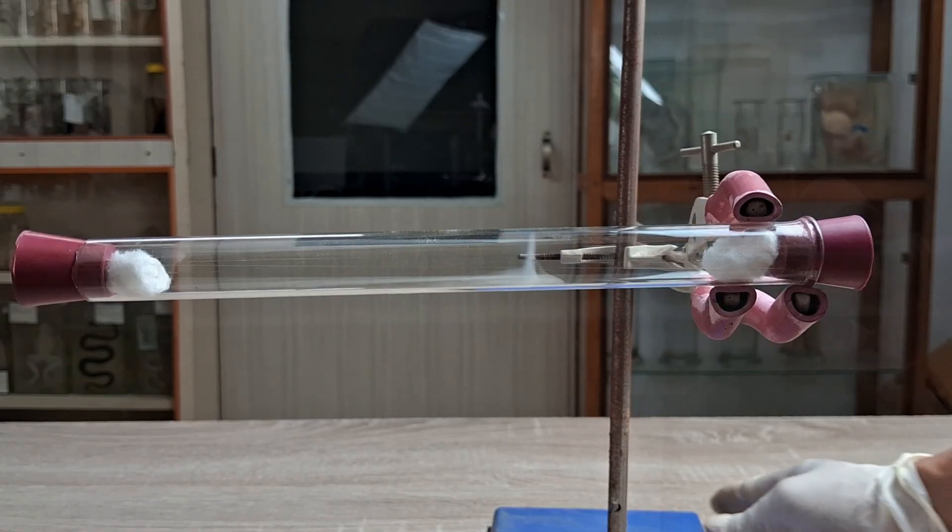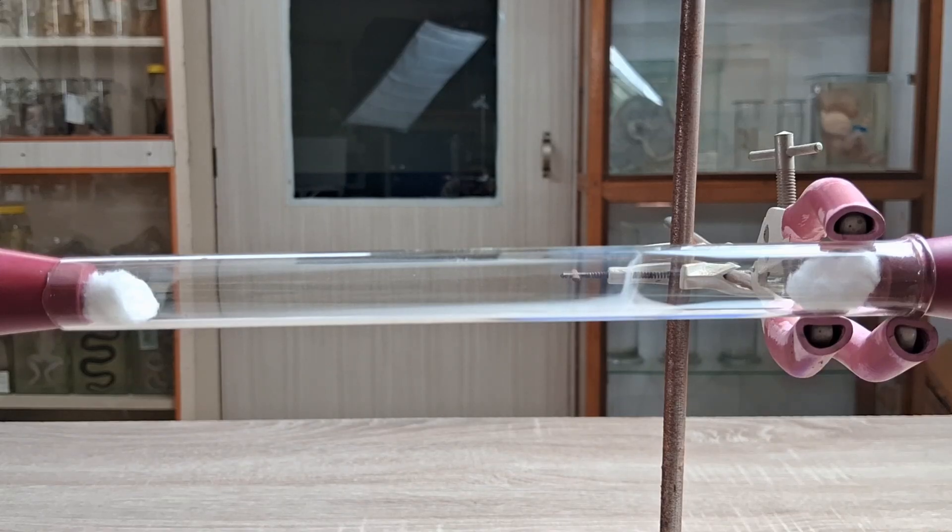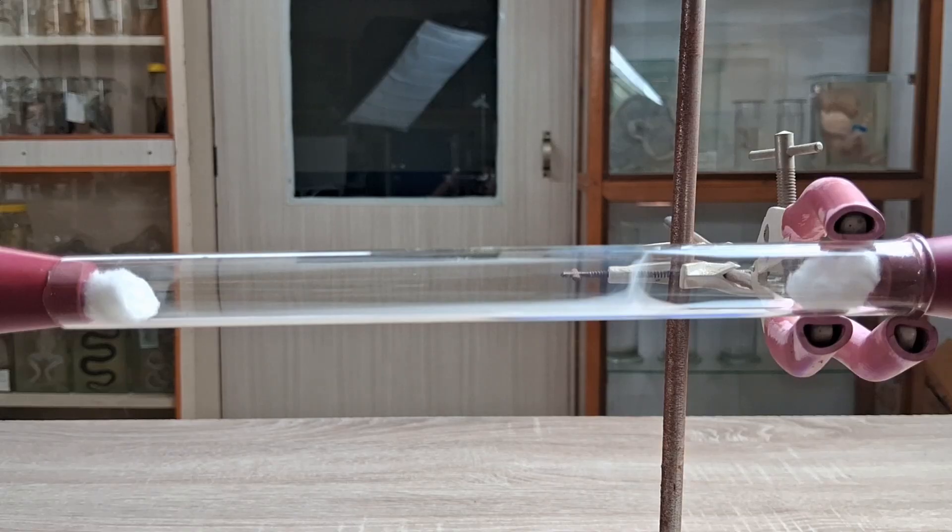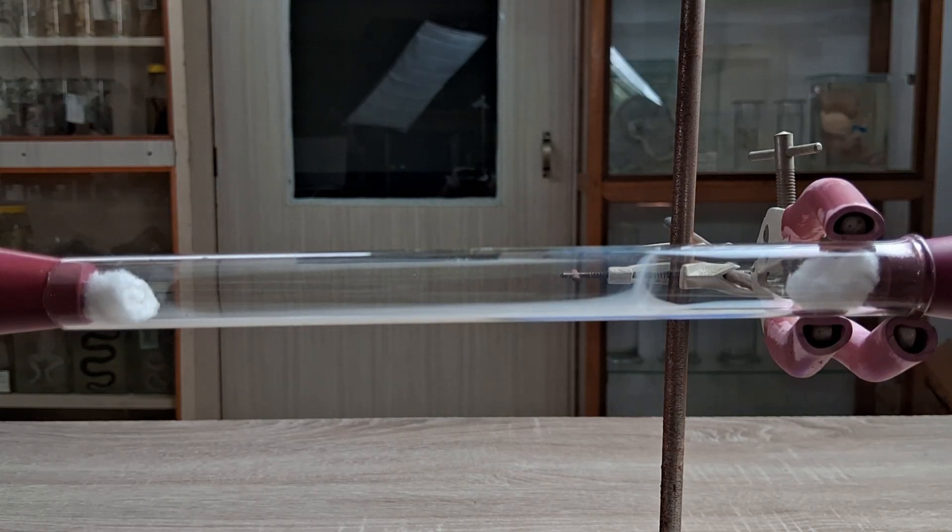The white fumes are more concentrated towards the hydrochloric acid side because the fumes of ammonia are lighter than those of hydrochloric acid and therefore travel comparatively faster, moving quicker towards the hydrochloric acid.